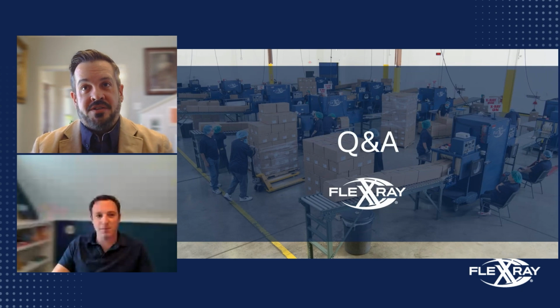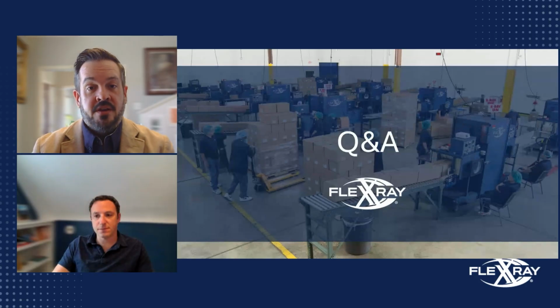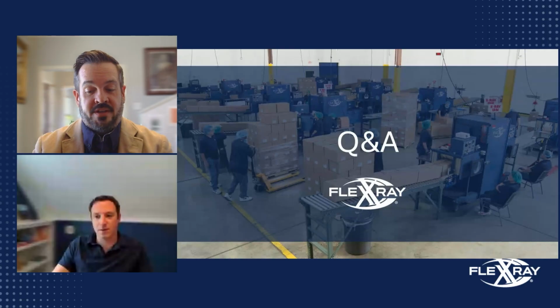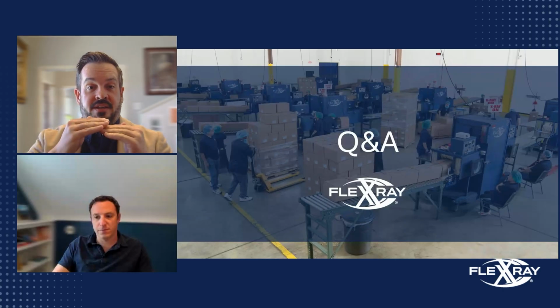That's a difficult question to answer outright because there isn't a set standard from a methodology perspective. Every engineering group within the food industry is going to approach a gauge R&R study about the effectiveness of their own inline instrument, and you're setting up the success criteria for those. For us at FlexXray, as it relates to detectability of a foreign object within a product, we're essentially imaging the product in its most difficult location in the center of the box and ensuring that we can detect that and separate the density levels high enough.